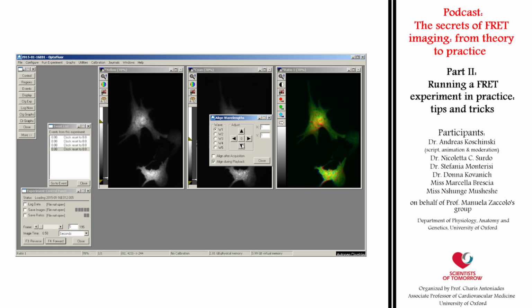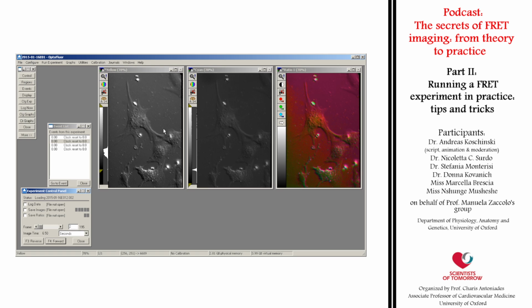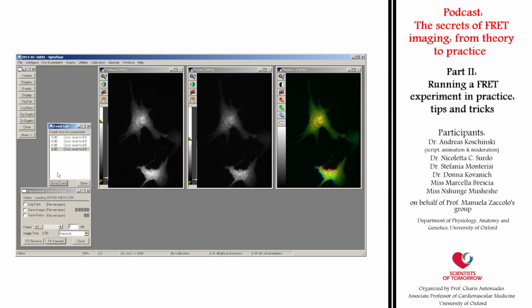As mentioned before, the alignment might not be perfect for the whole image. If you would like to analyze a second cell, you may need to do it in the second round after realigning for that cell. You can now close the alignment tool. Now look for a cell-free region where you can place your background ROI. The easiest way is to look at a bright field image you should have taken during acquisition.